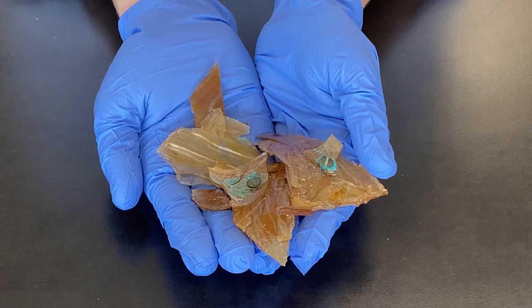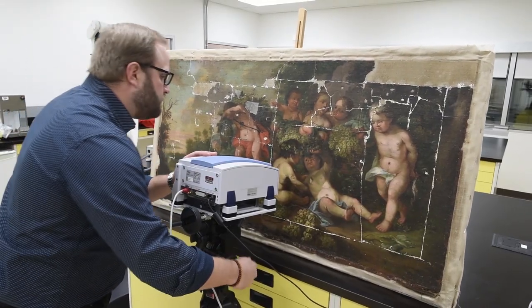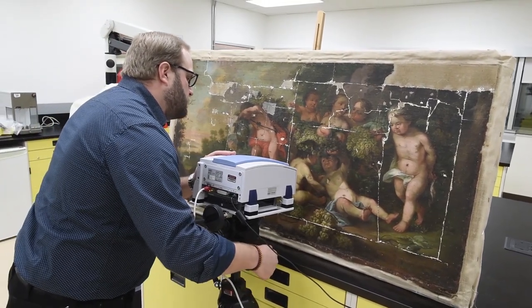Whether it be metal and glass corrosion, decaying plastics, pesticide contamination in collections, or worrisome smells and sights in storage facilities and display cases, analysis needs can be as individual as the objects themselves.